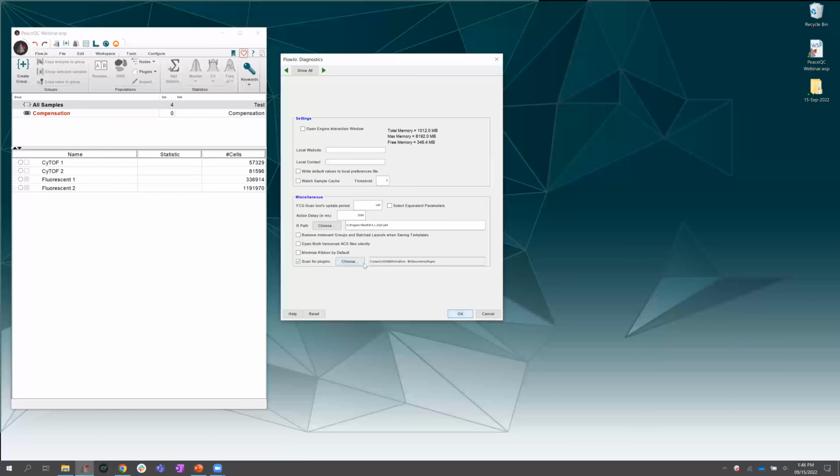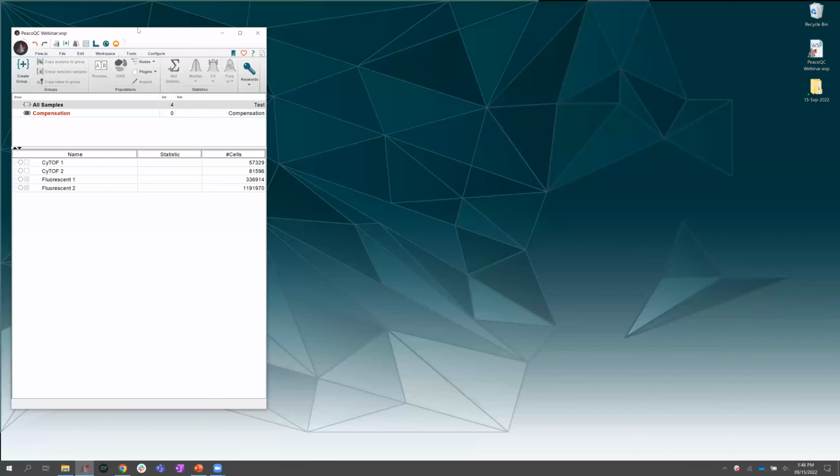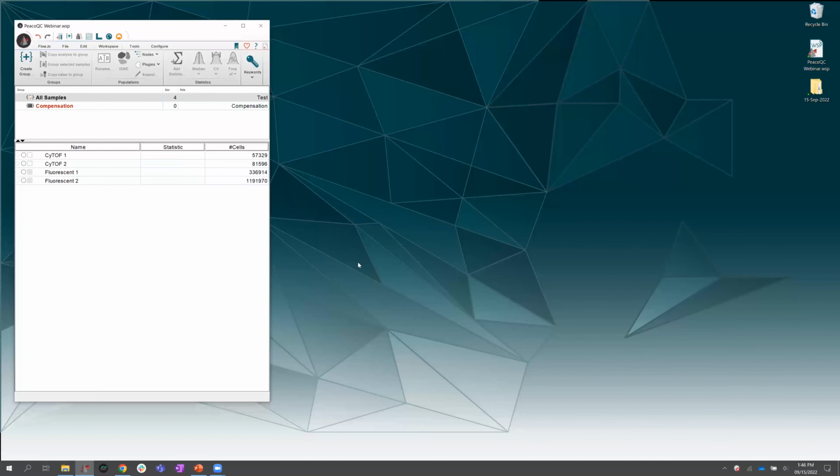And then you'll also need to tell FlowJo where your plugins are. Okay, so navigate it to where that folder is where you have that jar file and maybe your other jar files available. Okay, and then you'll need to restart FlowJo for these changes to save, and then you should be able to use the tool accordingly. Now I will say the first time you use any plugin, particularly if it has R dependencies, it might take an extra minute or two to run just because it's installing everything it needs. But moving forward, it should usually be a snap faster.